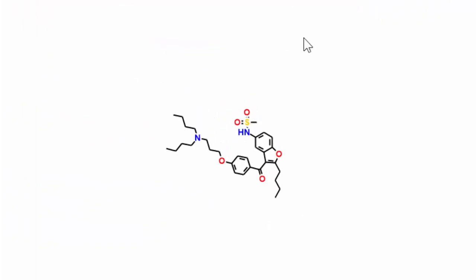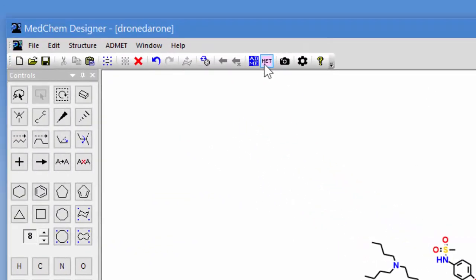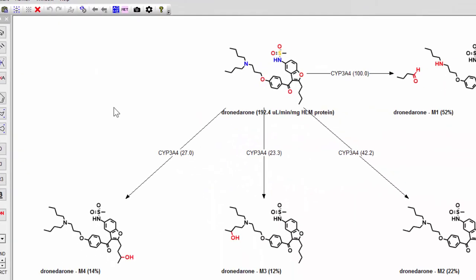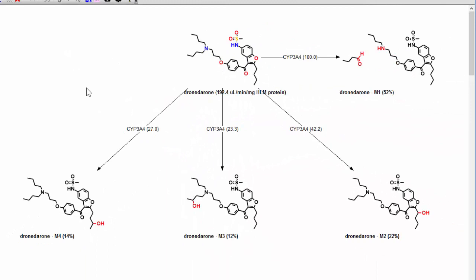I've opened Dronedarone in MedChem Designer and then I simply click on the MET button to generate the metabolites. Dronedarone is predicted to be a substrate for 3A4 and a non-substrate for the other four major CYPs.